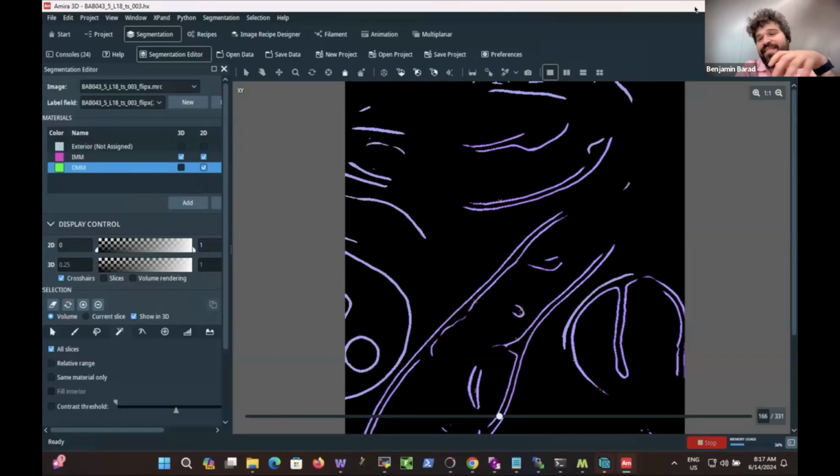The nice thing about segmentation is it's not really hard. You can just kind of do it. It takes a long time, but you get a good result, even if you don't know what you're doing, which I don't half the time. Versus if you know what you're doing, the cryo-EM and the data collection can go quite fast now. And this is a recent change. There's been about a 5-fold speed up in everything since 2019 because of advances to the way we do beam shift, image shift data collection, and the way we automate the milling. But because of that, the heavy load is very much on the data processing now.